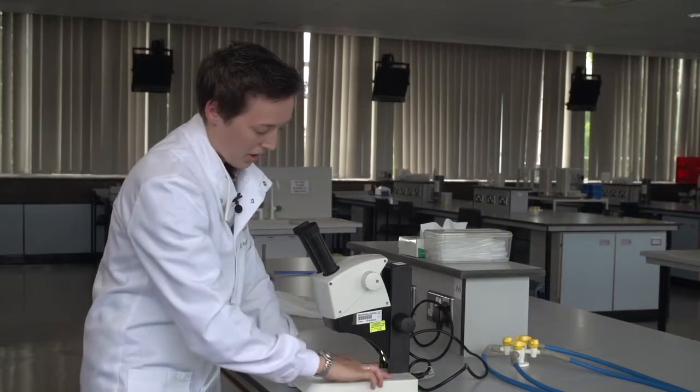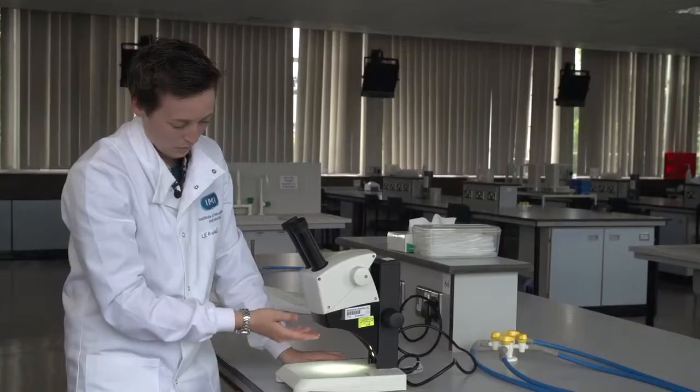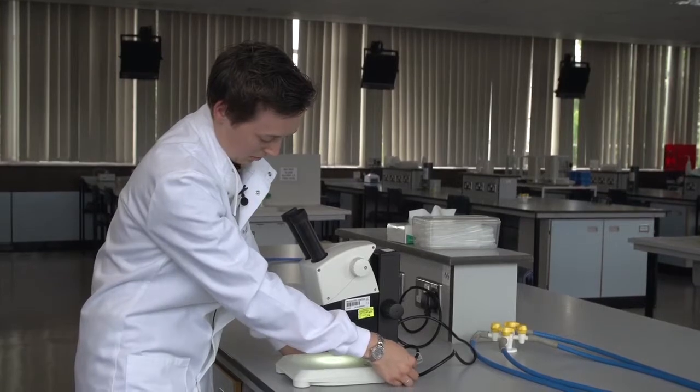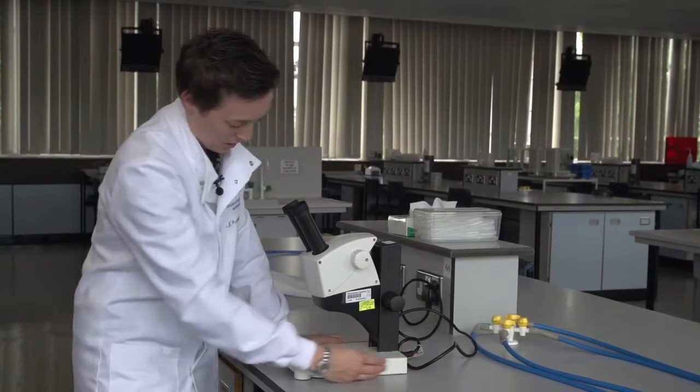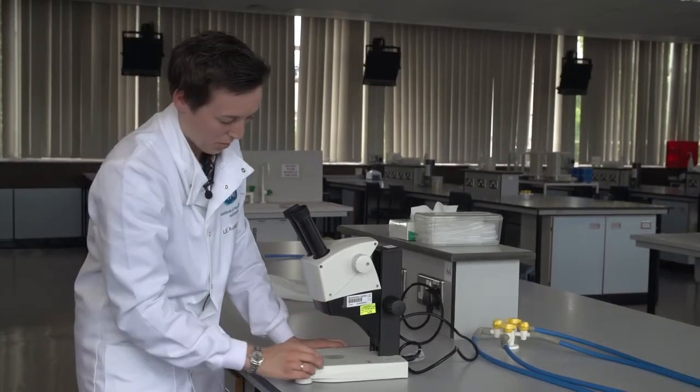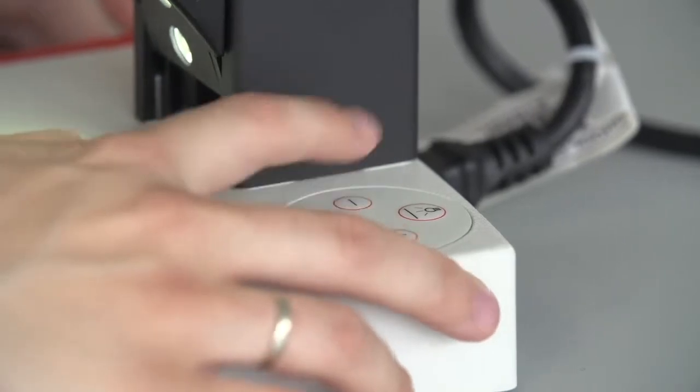On the front here is where we can adjust our light levels. At the moment we have the top lights on and we can change how many of the LED lights we have on at the top, and we can also have under lighting as well and change the levels of that.